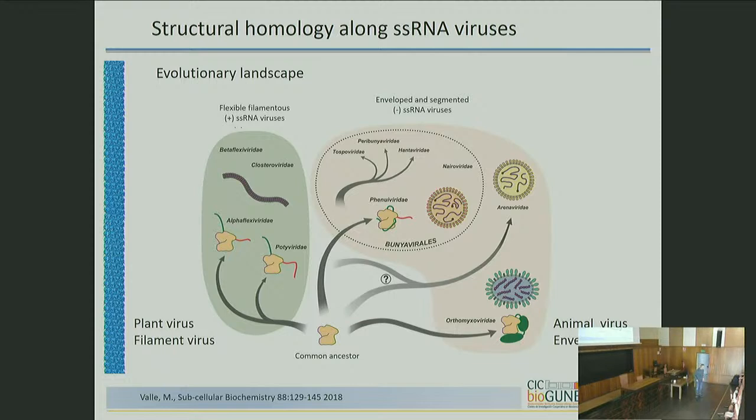Have you considered testing different RNA polymers to see if you can stabilize the protein fragment? Maybe you are lucky with some segment to see if you have better resolution.